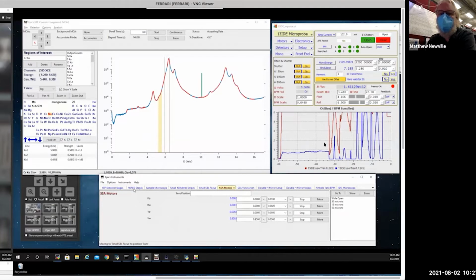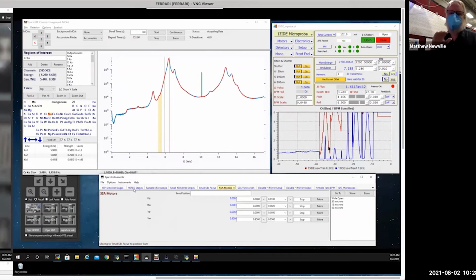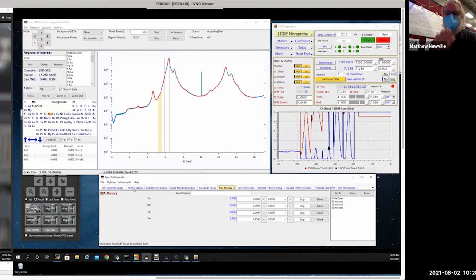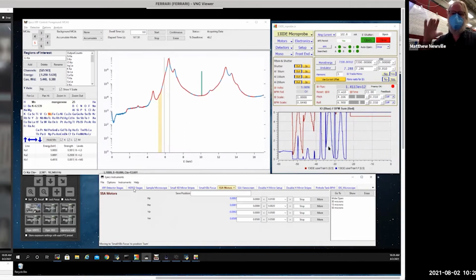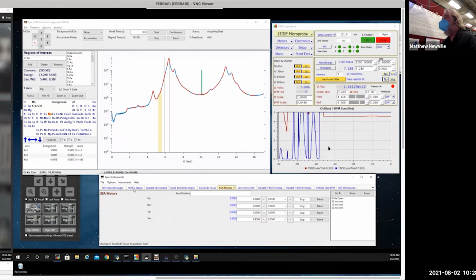And then these curves here that are being shown are that the monochromator has two crystals. A first crystal that's liquid nitrogen cooled that really sets the axis and the angle and defines the energy. And then a second crystal that is parallel to it, so reflects the beam back with a constant height offset of about 25 millimeters. But that also has two piezoelectric crystals that we can use to steer the beam a little bit. So what that was doing was just working on steering the beam.